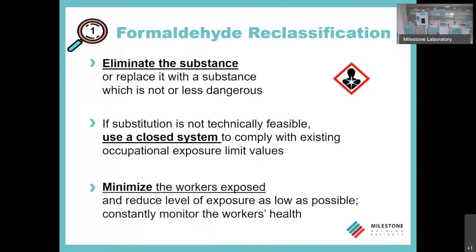So what is necessary to do when a substance declared carcinogenic needs to be handled and is present in the environment? Well, first of all, the regulation indicates that it's necessary to try to eliminate the substance or replace it with something less dangerous or not dangerous at all.